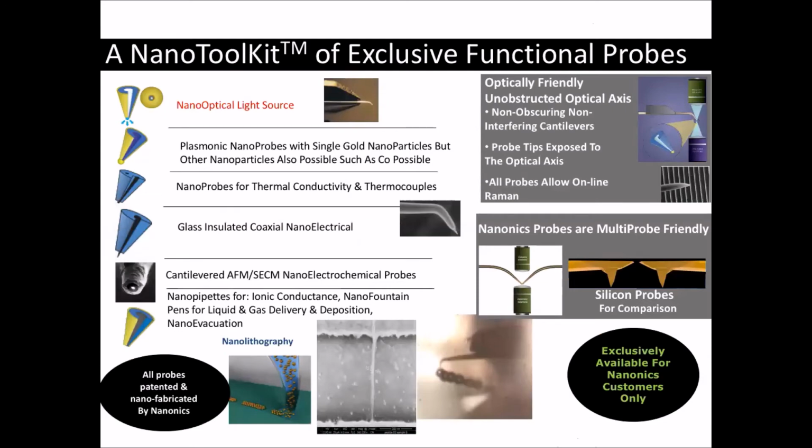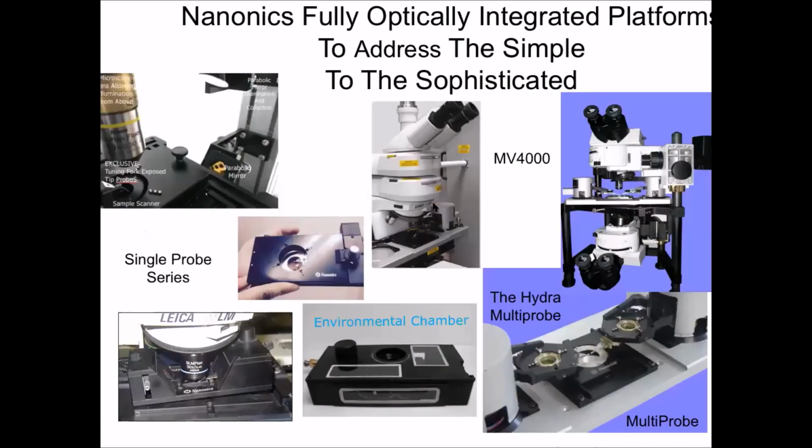Moreover, what's very exciting about this methodology is that you can bring these probes in physical contact with one another. So you can have more than one probe. In fact, you can see this is the probe, this is the lens. You can have all sorts of illuminations, side illumination, for example, if you want to have a plane illumination, which is very important in biology today. You can have multiple probes, okay? And you basically have everything with a completely free optical axis.